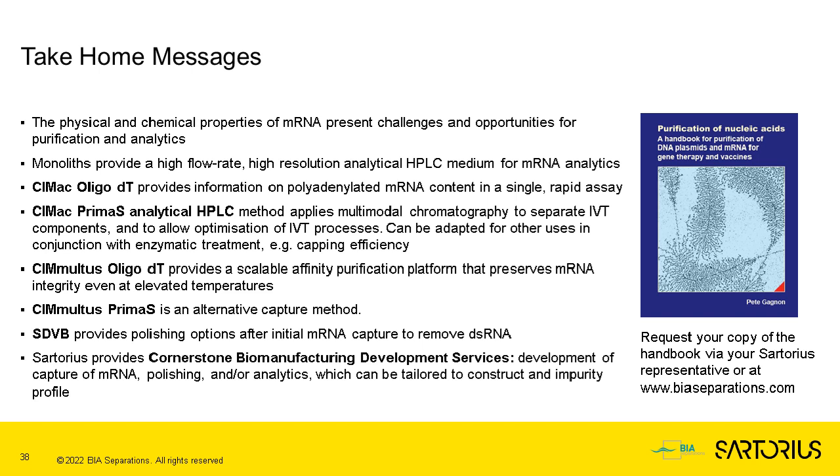So if there is a reagent, perhaps, that has an issue, this will be picked up by the kinetics. If T7 polymerase, for example, has undergone any kind of quality incident, the reaction will be slower. This will be picked up early on and marked as a deviation, so you can actually respond to a quality event earlier. And of course, this is an IPC, so it's an in-process control method, and I would certainly recommend monitoring production runs, at least for info only, and perhaps in the future also as part of batch records.